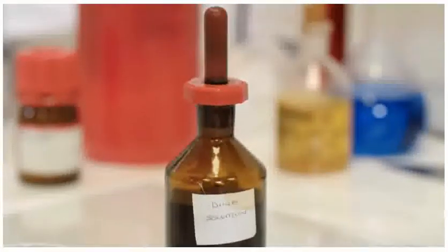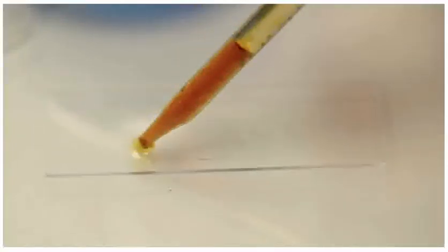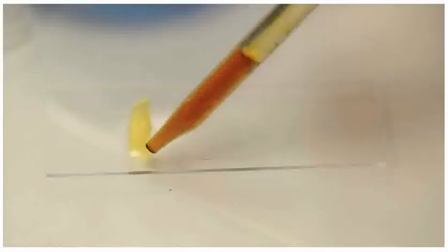Excess water is soaked up using filter paper. Iodine solution is used to stain the cells to make it easier to see different structures. A drop of iodine solution is added at one edge of the cover slip. A piece of filter paper is held against the other edge so that the iodine solution will gradually move underneath the cover slip.